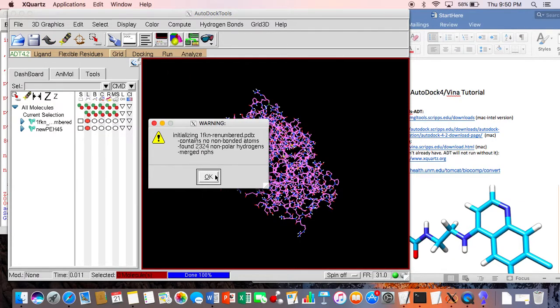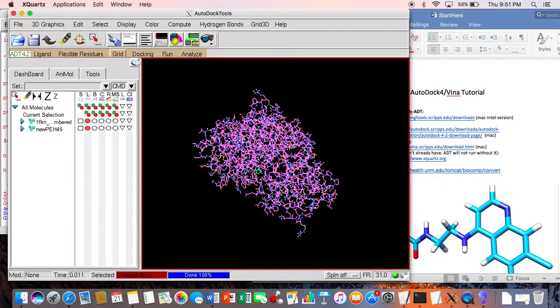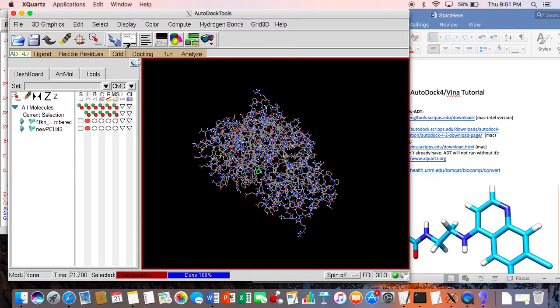Oh yeah, I forgot. That's why I'm going to take this. So you're going to hit OK. It's going to ask you to save. So this is one of the files you're going to need for later on. This is the PDBQT file for the 1FKN. And this one always comes up. Next, we can choose.